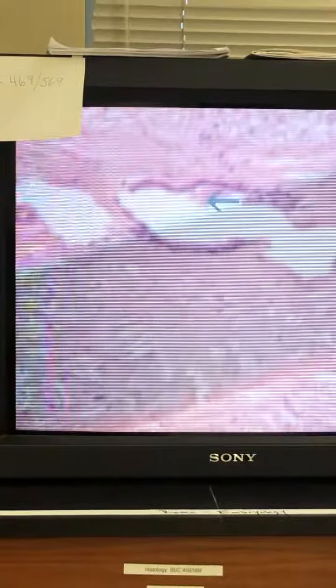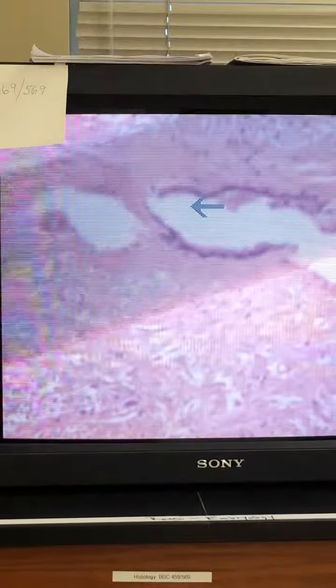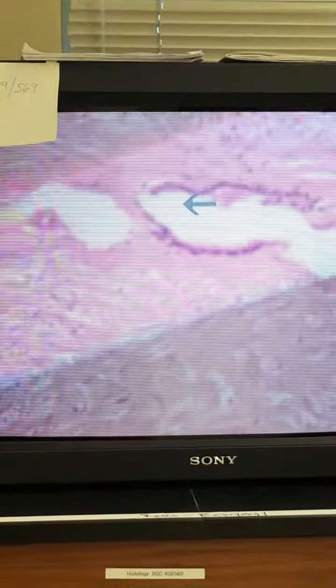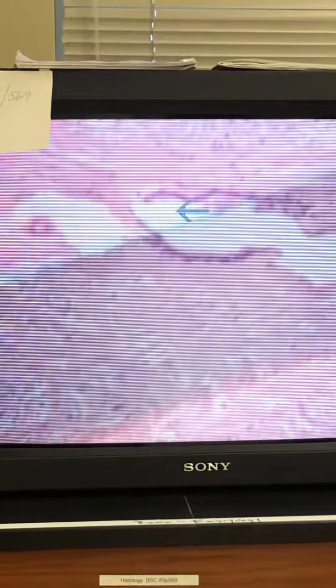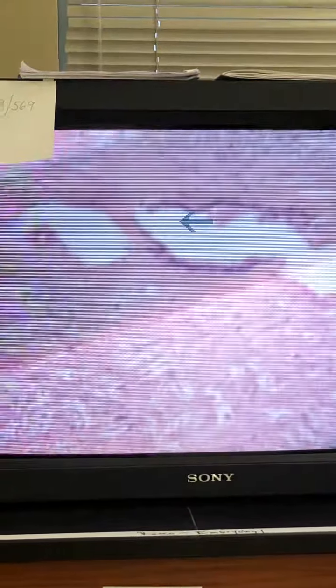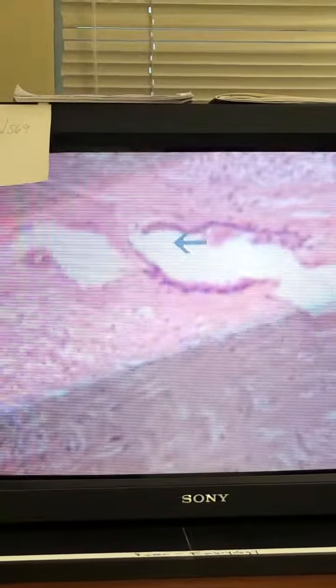Okay. And then if I said name the apical modification, that'd be up to you to figure out whether it was, like, if it looks like a little fine brush, then they're microvilli. If it's more like separated, you can sort of see separate ones, then that's cilia. And I'd have to find a really good slide. Not all these are so good for that.